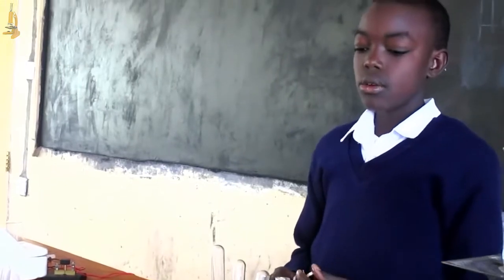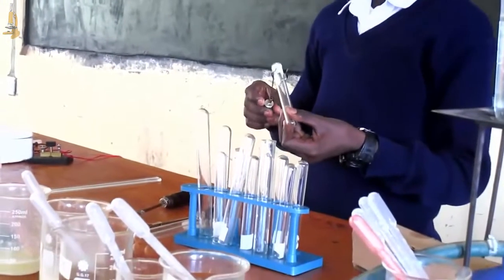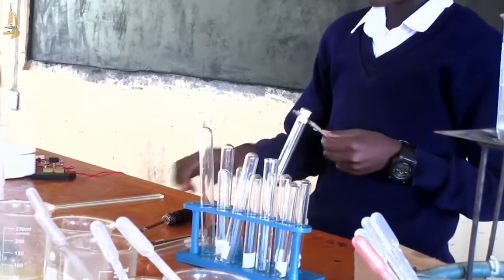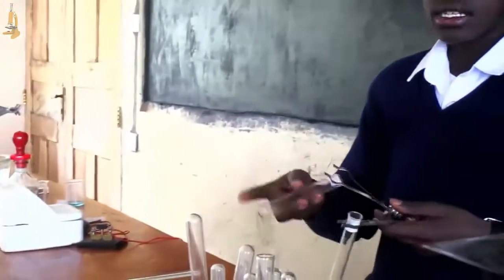I am going to welcome the first presenter. My name is Ryan Vedasto, Form 2 at Kisimiro Secondary School. In food tests, we are going to test if a food sample contains starch. First, we are going to take our test tube of sample B and put it in our test tube holder, and a test tube of sample C and put it in our test tube holder.